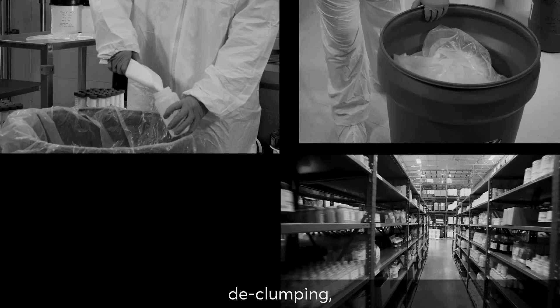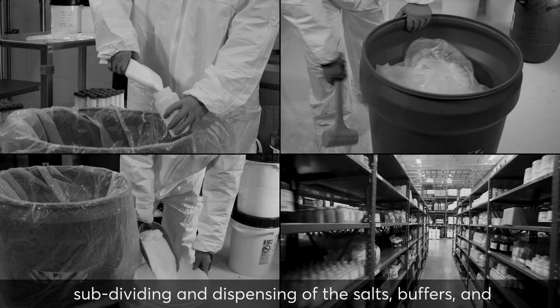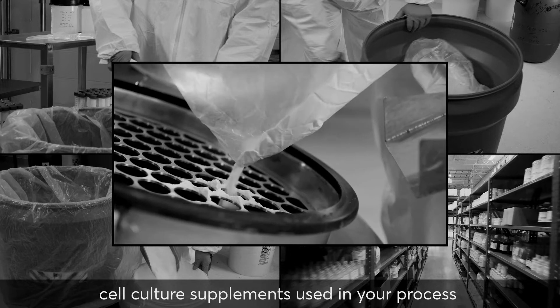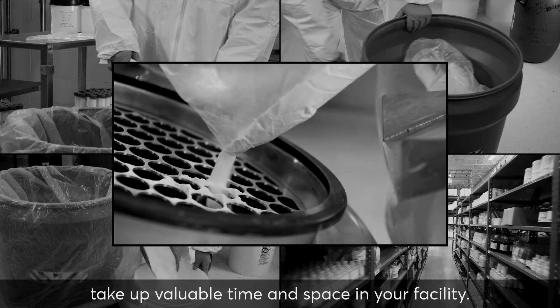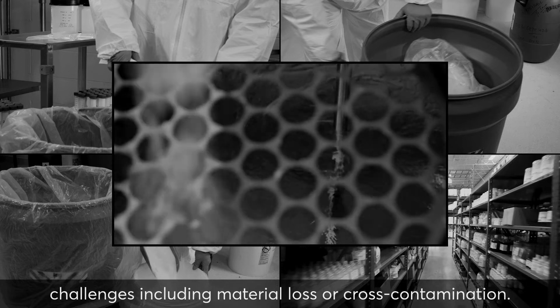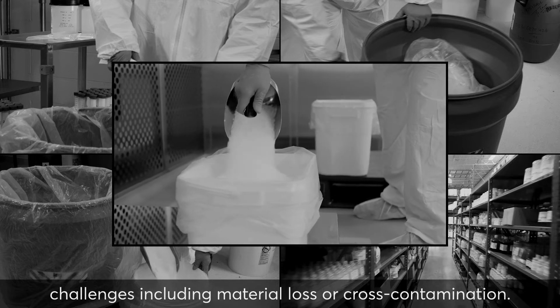The sampling, warehousing, declumping, subdividing and dispensing of the salts, buffers and cell culture supplements used in your process take up valuable time and space in your facility. The cost of these steps can be significant and may cause challenges including material loss or cross-contamination.